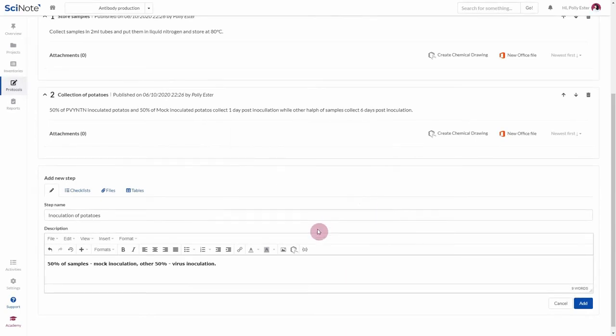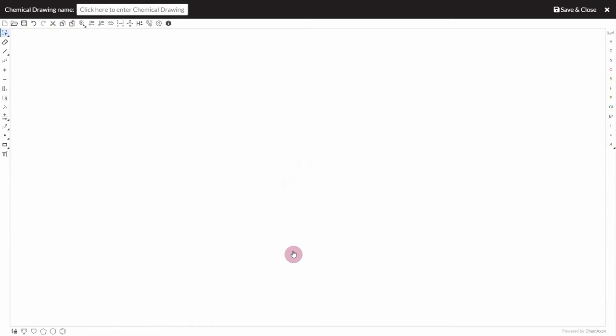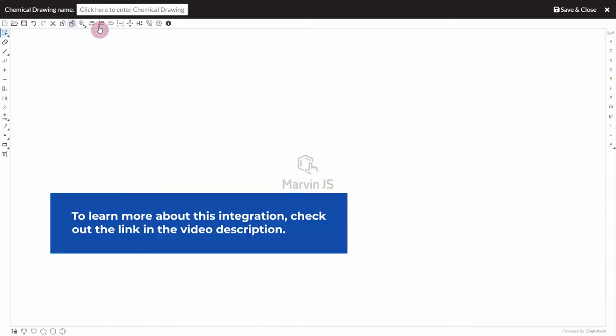SciNote is integrated with ChemAxon's MarvinJS chemical drawing tool. You can draw, edit and embed your chemical drawings directly from here.